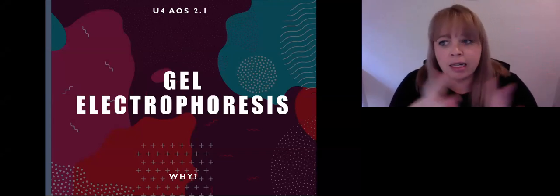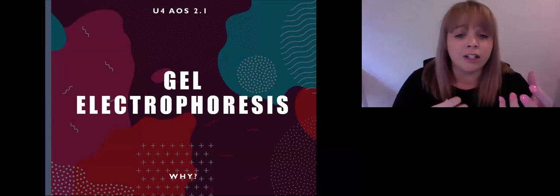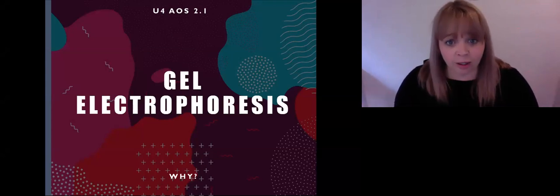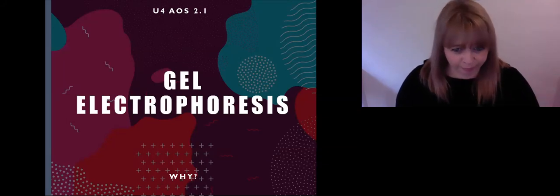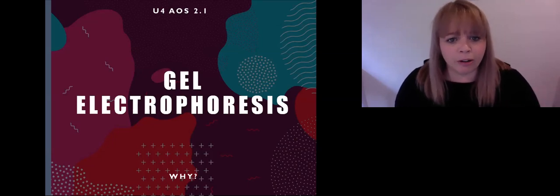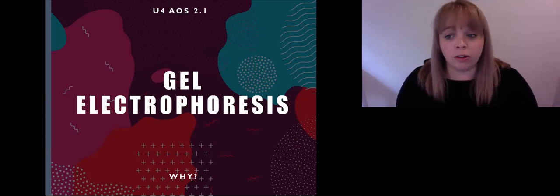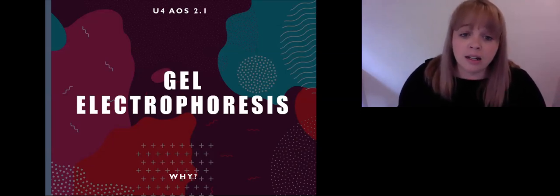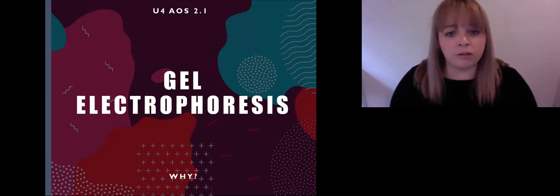So gel electrophoresis, I've actually broken up into a series of different videos where we talk about what and why, then we talk about how you do it, and I'll go through an online simulation as part of that, just because some of you might not have Flash, or you might want to go through with me how much you want to write down. Then we're going to look at how it works and what factors influence it working, some examples, and then finally the ladders and the standards. So we're going to do quite a bit of work on gel electrophoresis.